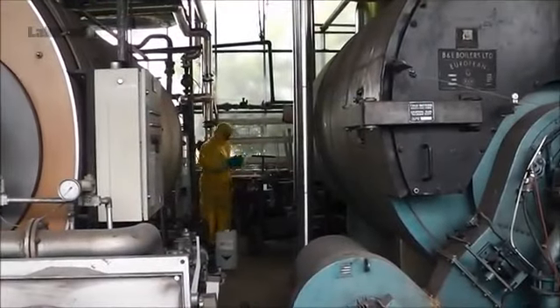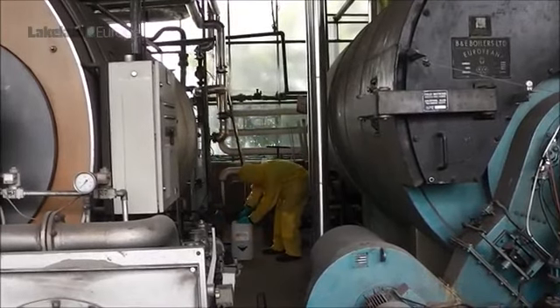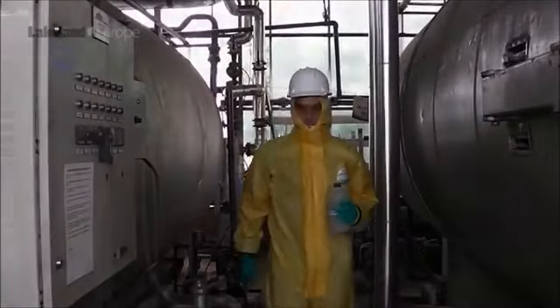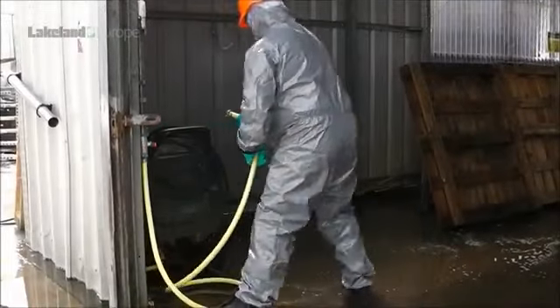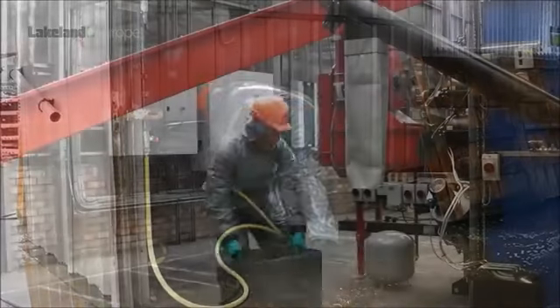Lakeland CE certified Chemmax chemical protective coveralls are made to a high specification with superior design and features. They provide excellent protection against a wide range of hazardous chemicals in a variety of applications and industries.